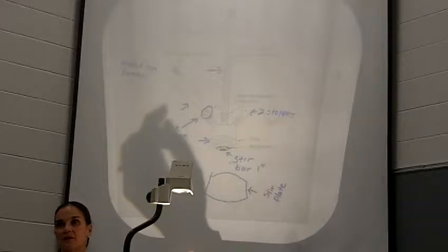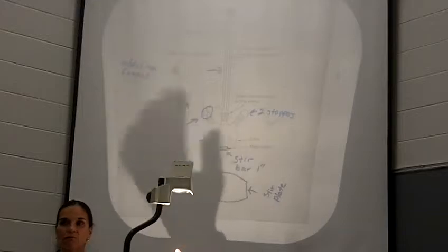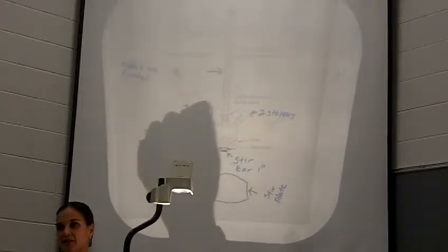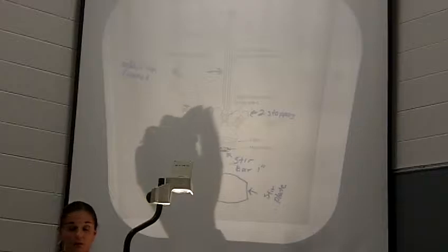Yes? So we put the magnesium in first, 10 milliliters of ether, then turn the stopcock horizontal, ether, and then alkyl bromide. Well, you could have the stopcock already there. You're not going to add your ether and magnesium through this, so this could already be horizontal. Oh, okay. You just want to make sure this is horizontal before you add any liquid to it.